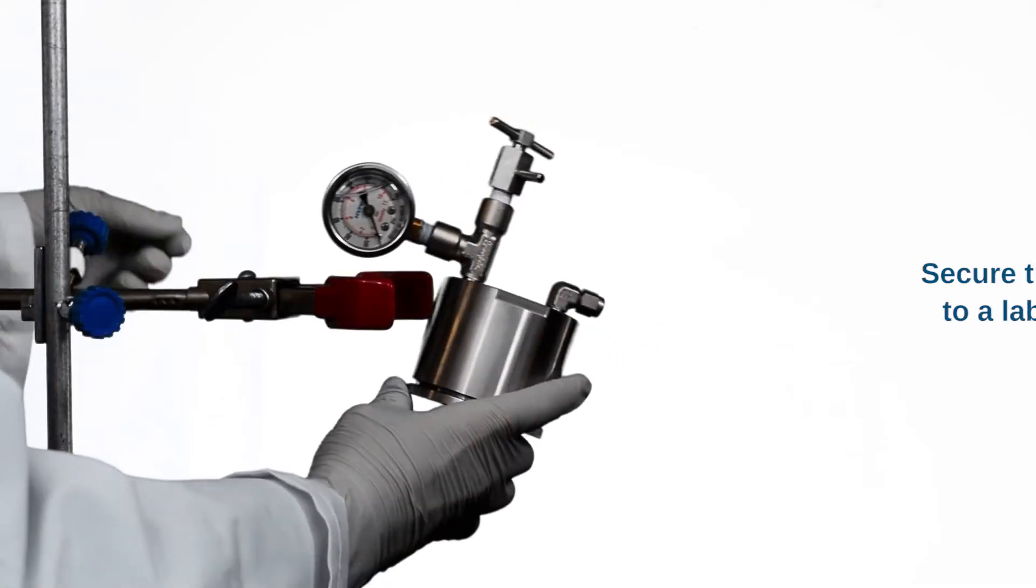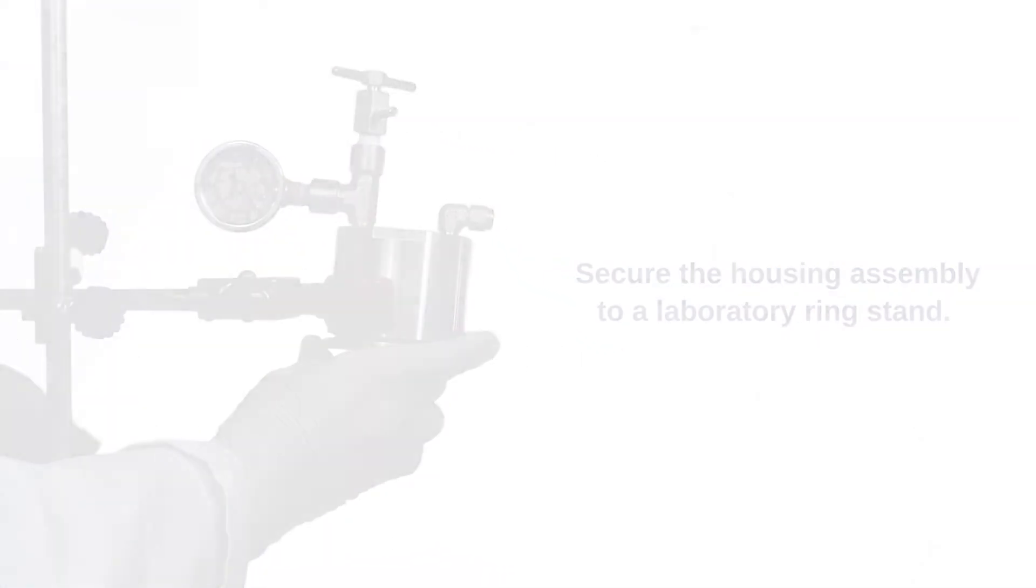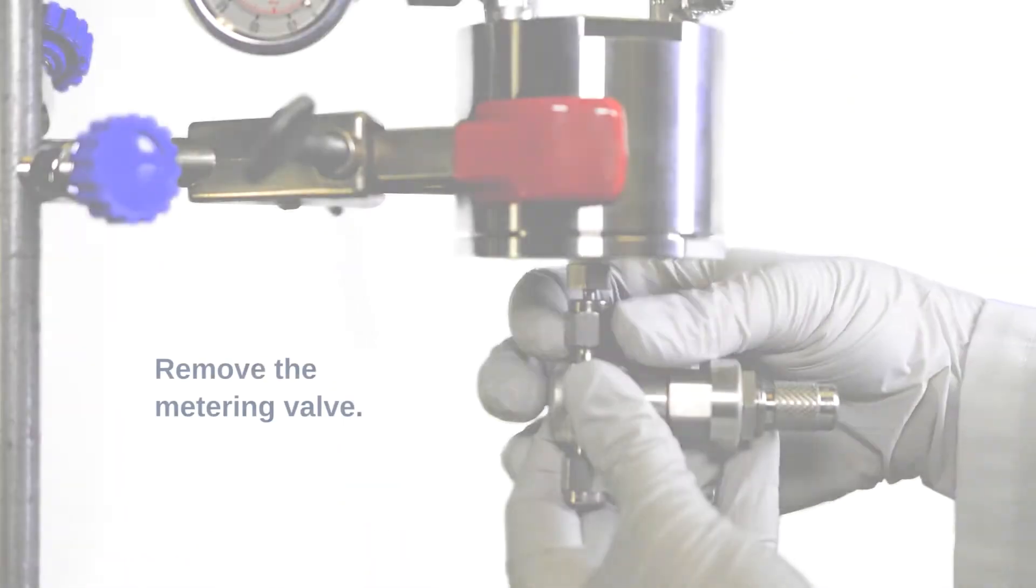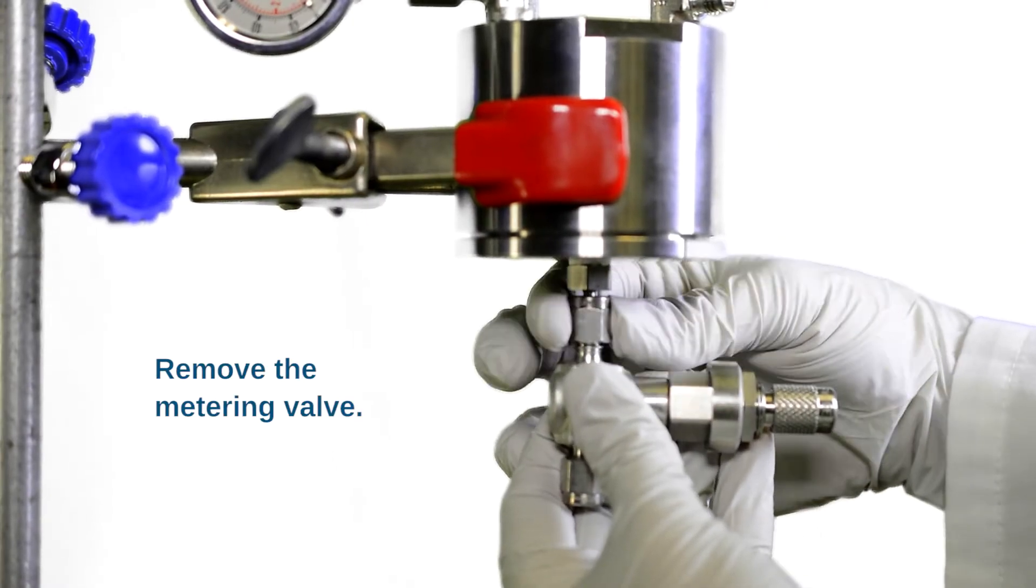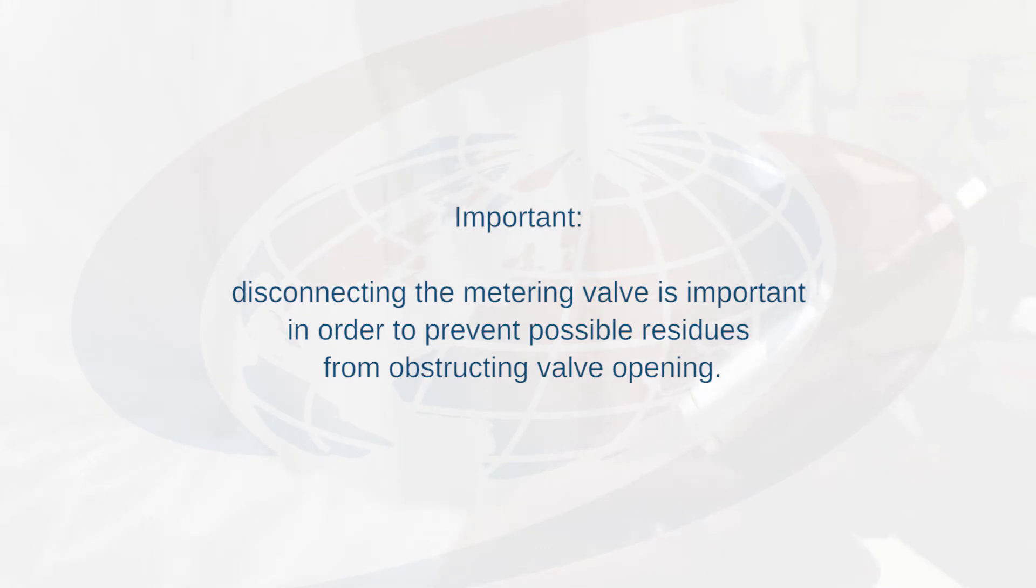Secure the housing assembly to a laboratory ring stand. The air bleed valve should be at the top of the assembly. Remove the metering valve. Disconnecting the metering valve is important in order to prevent possible residues from obstructing valve opening during conditioning.